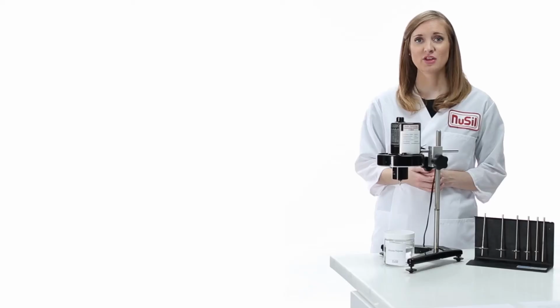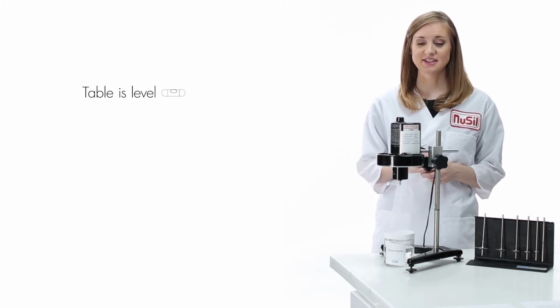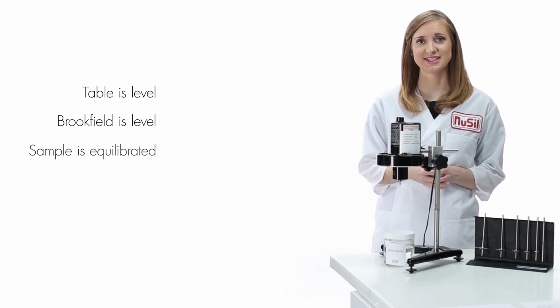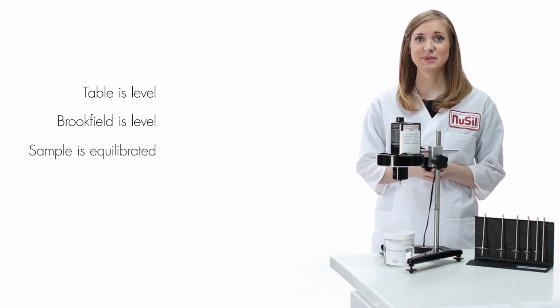Sample preparation is critical to getting accurate results. The first thing to check is that the table that you're using is level. Second is that the Brookfield is level on the table. Third, you want to make sure that the sample has been equilibrated at the temperature you wish to test. Our NuSil silicone polymer that we're testing today has been in a water bath at 25 degrees C for 30 minutes. Lastly, make sure there's no air bubbles in your sample. Centrifuge or de-air your sample before you test. For more information on sample preparation, visit nusil.com.